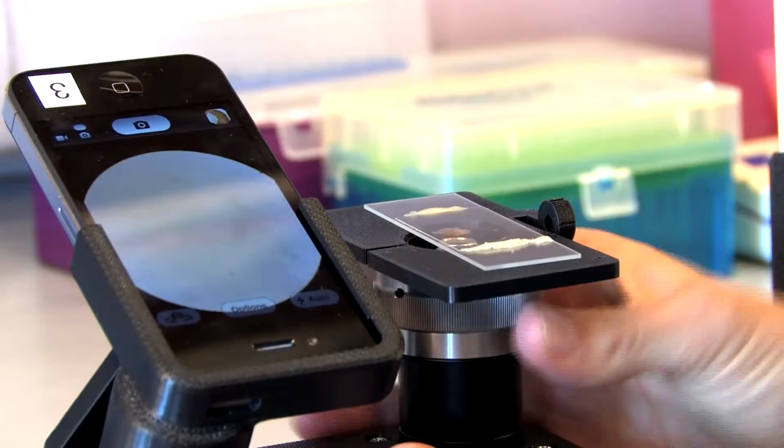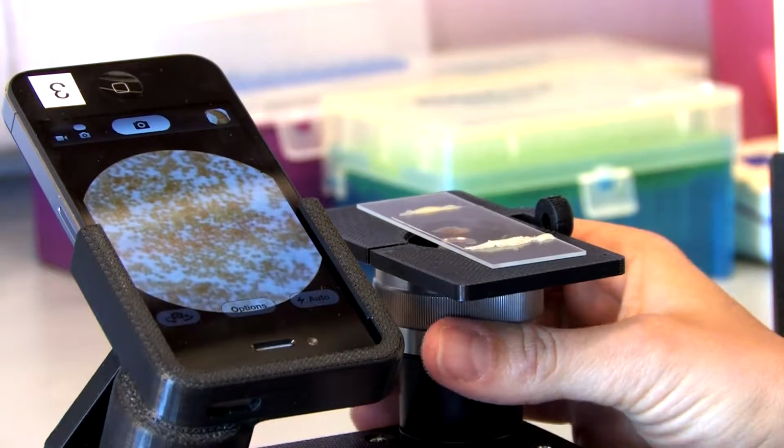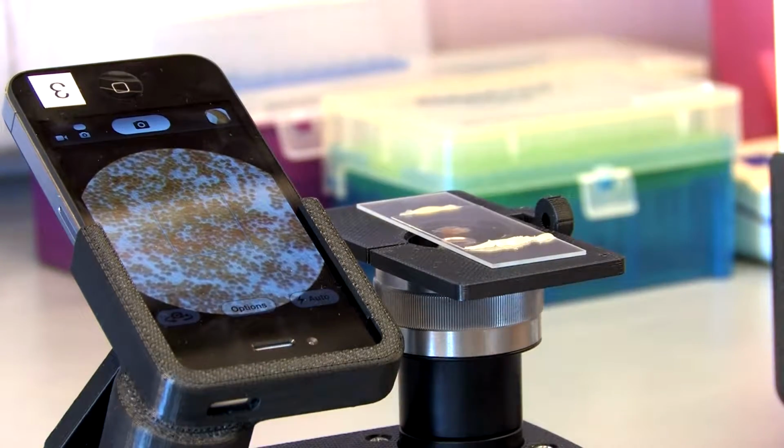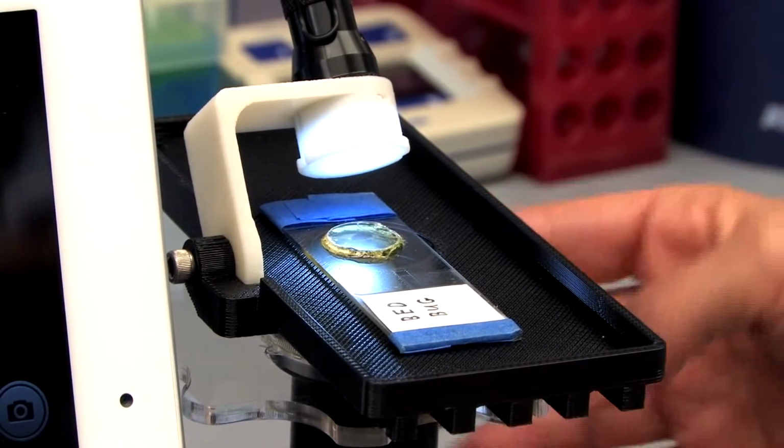The original Cellscope that was developed from that was a very simple device that could use the cell phone as a camera and take pictures of microscopic samples. We print the parts, the plastic parts are printed on our 3D printer here in the lab.